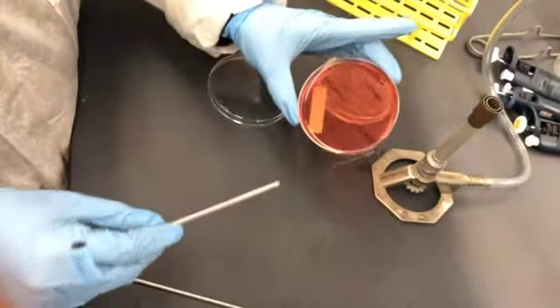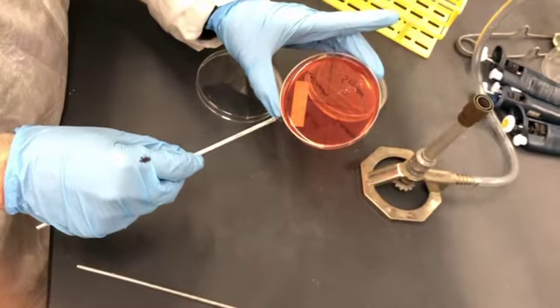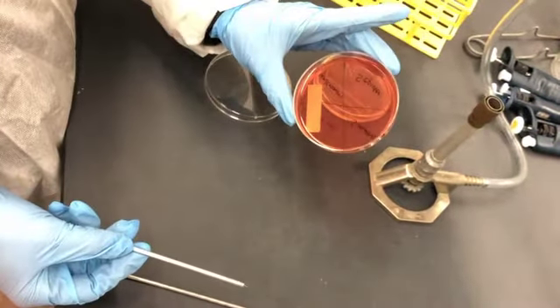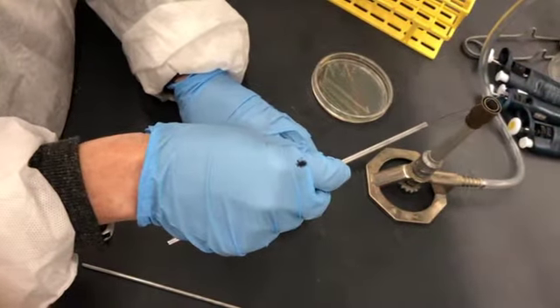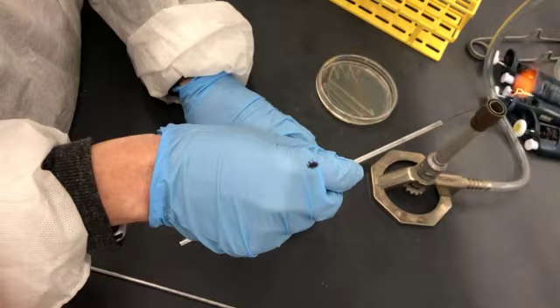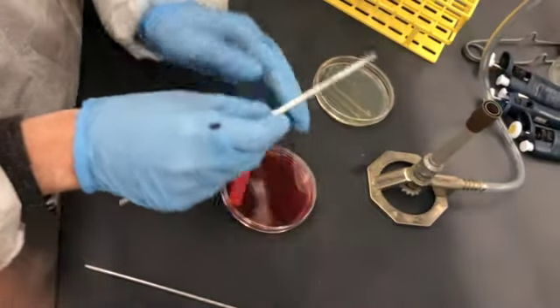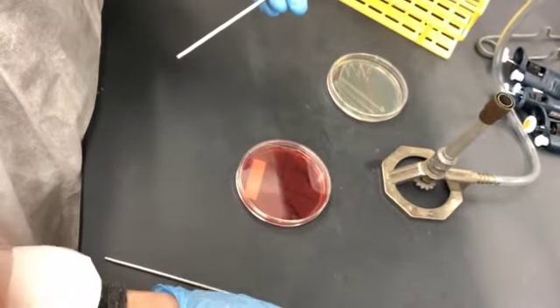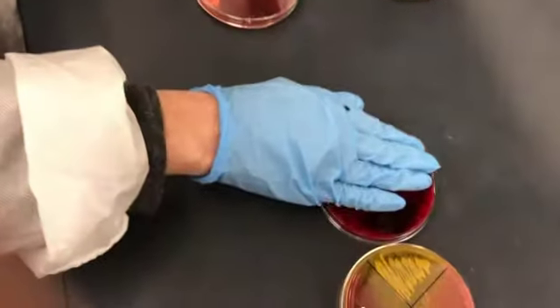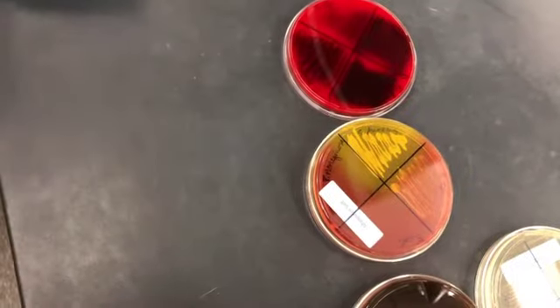So here I can see my quadrant, I have my loop, and I'm just going to conduct a little zigzag on that surface. Of course, you're going to want to heat sterilize your loop between all the bacteria. You might even choose to label all of your plates, for example, down here, and then inoculate E. coli in each of the different types of media to be more efficient.